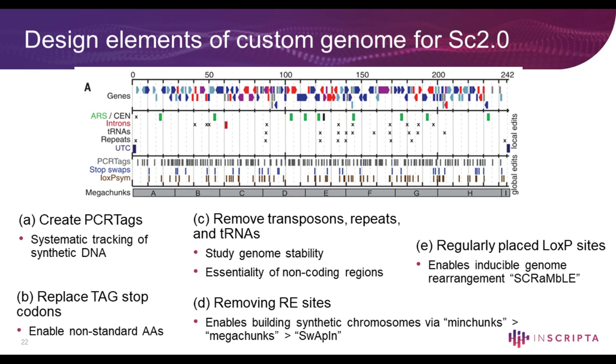So this is very common. As strain engineers, you probably know that repeated engineering does cause strain on growth. And that is exactly what they saw in this case as well.